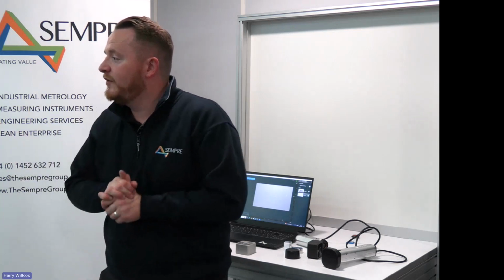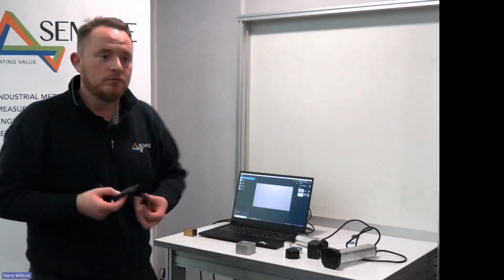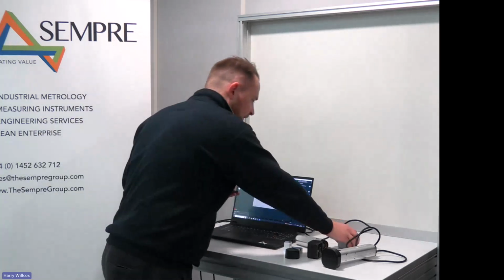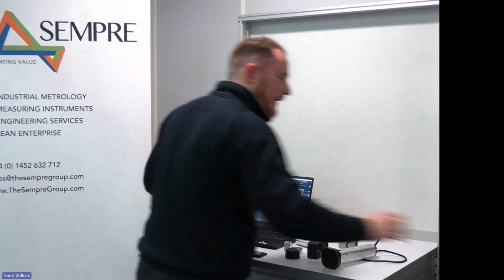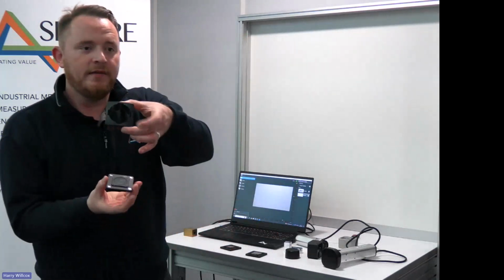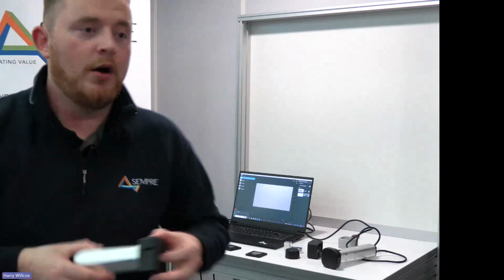You mentioned calibration. What's involved? Okay, that's a good question. To my right here, we have our calibration artifacts. The way we calibrate the system is we take a scan on what's called our optical flat. So you can see, hopefully, we've got our optical flat. The idea behind the calibration routine is I take my sensor, we've got an aligner for the calibration, I take the probe, and we take a scan like this on our optical flat.